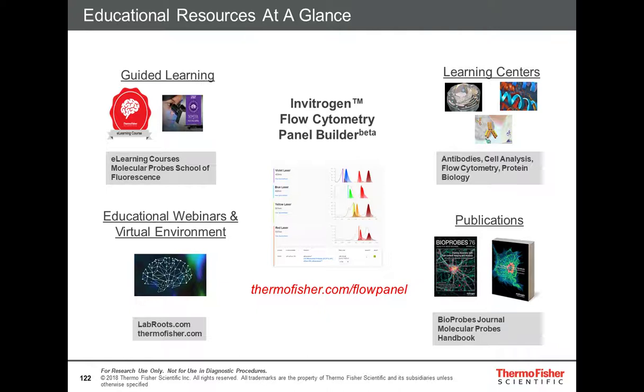And we're going to have time for one more question. I don't have FlowJo. Is there any other way to generate a spreading matrix?